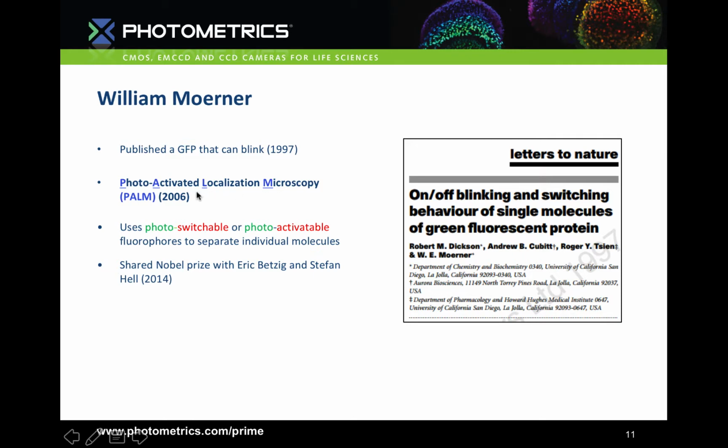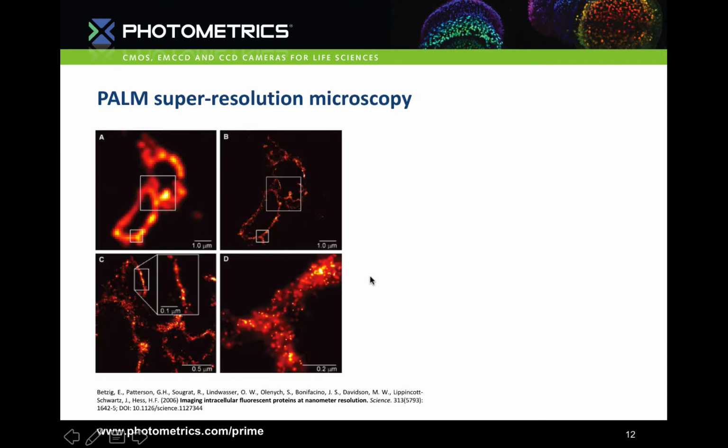This discovery led to William Moerner, Eric Betzig and Stefan Hell receiving the Nobel Prize in 2014 for introducing the world to super-resolution microscopy. So Betzig was able to create this beautiful super-resolution image using PALM with the photoactivatable GFP. But how exactly does PALM work?